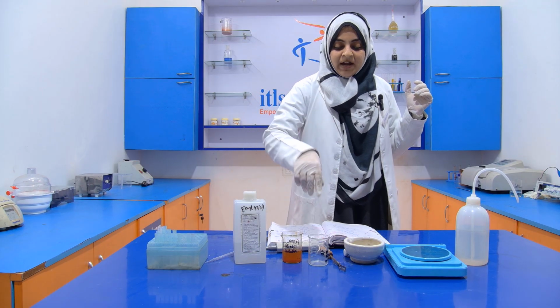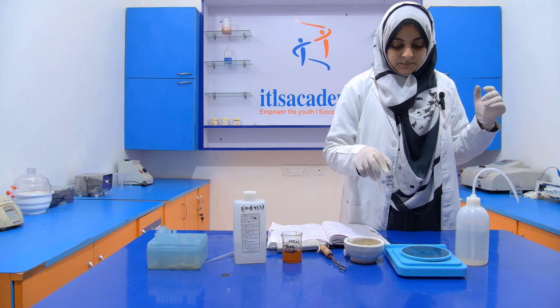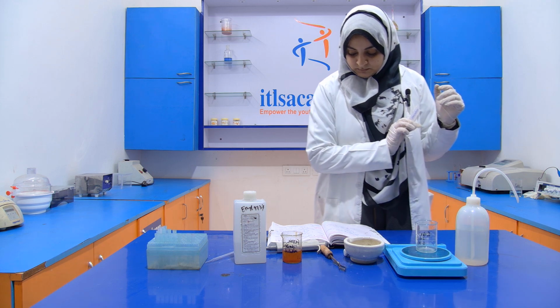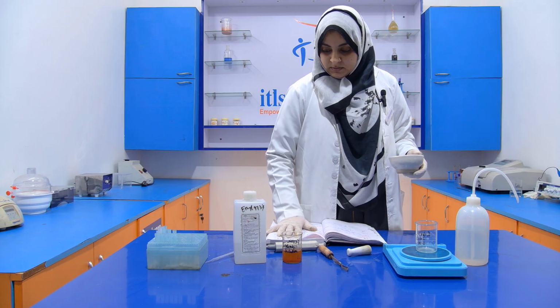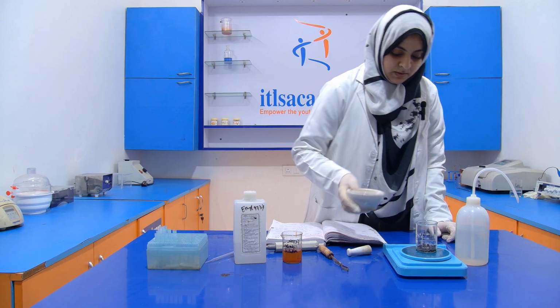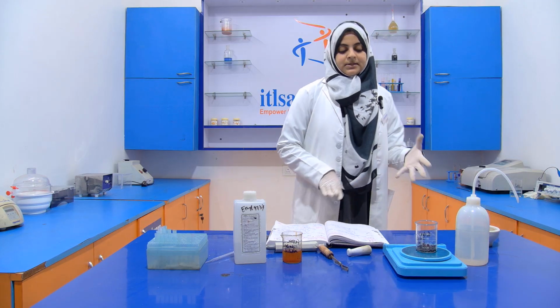Now first of all we have to take the weight. We have 5 gram of this black pepper.